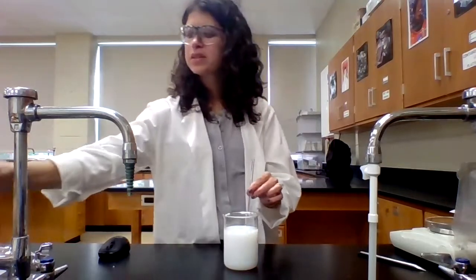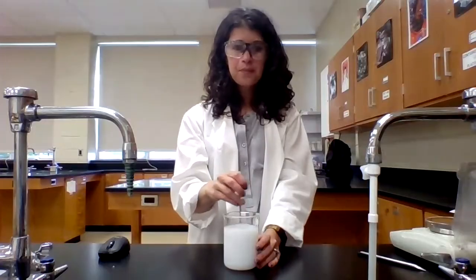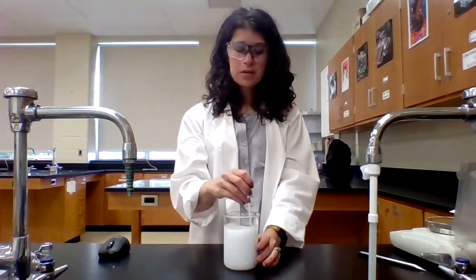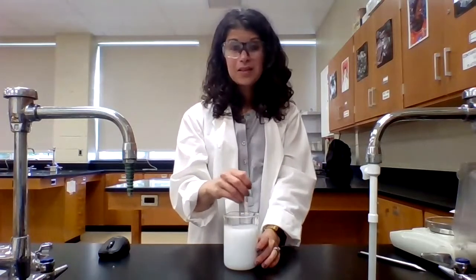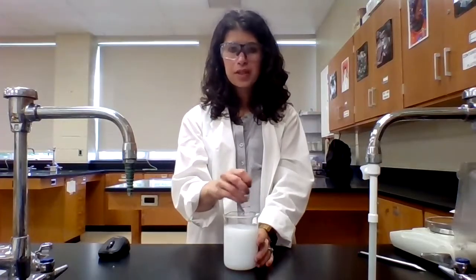Now, obviously the reaction started. I still want to stir though, to make sure that I get a complete reaction. So I'm going to be stirring this for about 5 minutes. And then I'm going to let the precipitate settle down to the bottom. As we'll talk about, that's going to make our filtration a little bit easier.